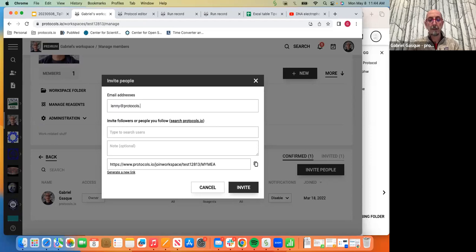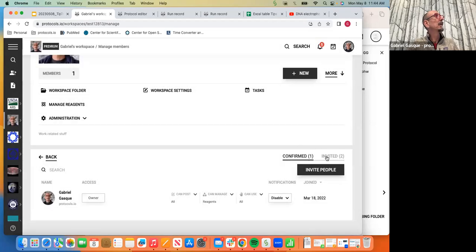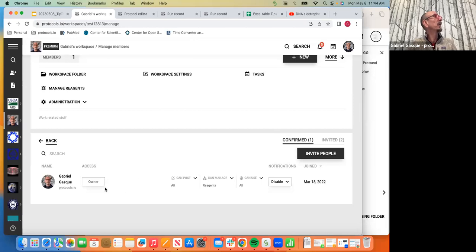And then add them. And once I invite people, they will appear here. And if they accept the invitation, they will appear here. So that's the way to invite people to the workspace.